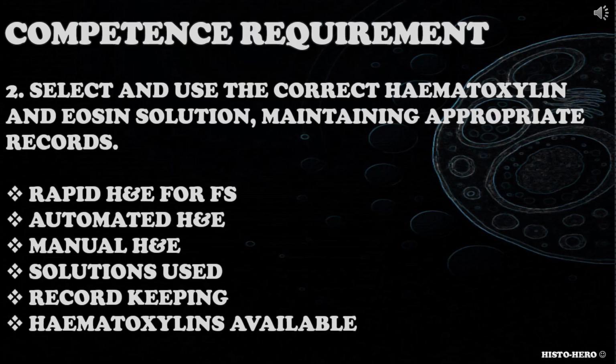When addressing this competence requirement, candidate could consider rapid H&E staining for FS, routine automated H&E staining, manual H&E staining, solutions that are used for each method, record keeping.